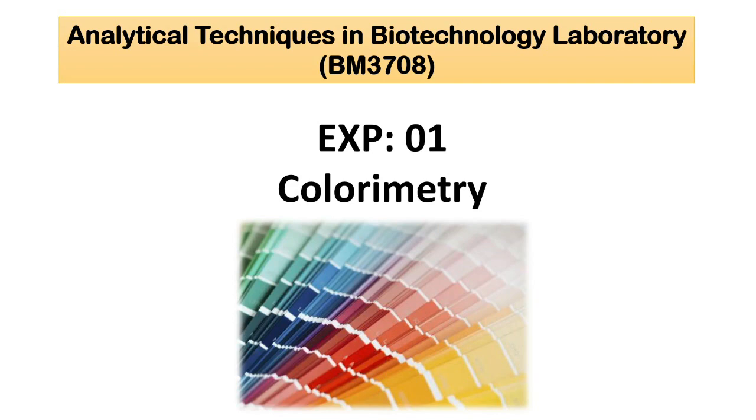In these experiments, first we will start with colorimetry, then slowly get into spectroscopy, because colorimetry forms the basis of the spectrometric technique. When we talk about colorimetry, we talk about three specific wavelengths, say red, green, and blue.